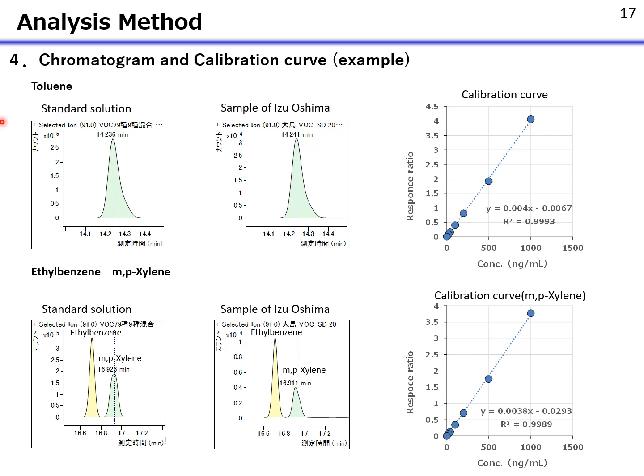The chromatogram and calibration curves for toluene and ethyl benzene and meta plus paraxylene are shown next. Again, the chromatograms are well shaped and the calibration curves are straight. No intercept of the calibration curve was observed for toluene and metaparaxylene.